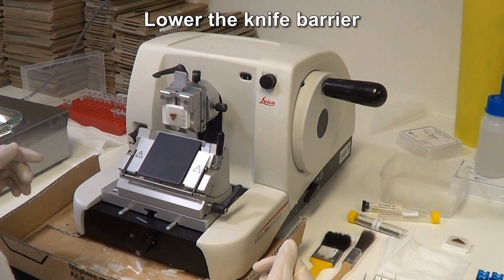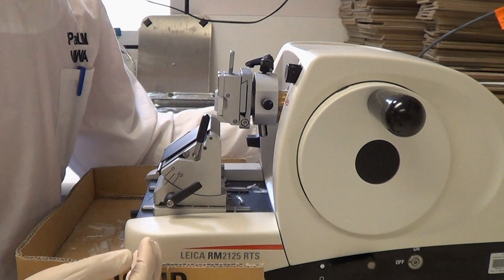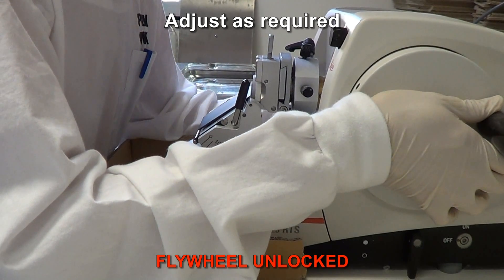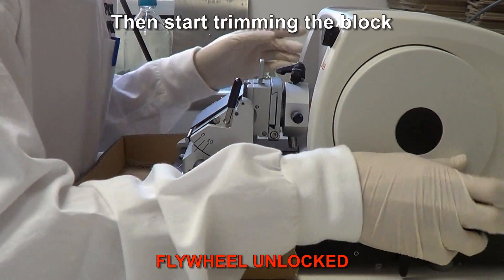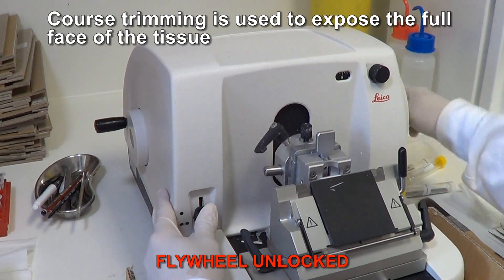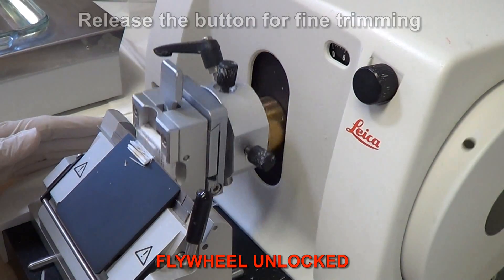First, lower the knife barrier. The block can be moved back and forth using the wheel on the left hand side of the microtome. Check the position of the block relative to the blade and adjust if required. Then start trimming the block. By pressing the button on the left side of the microtome down, the trimming thickness will be doubled. Coarse trimming is used to expose the full face of the tissue. Release the button for fine trimming.